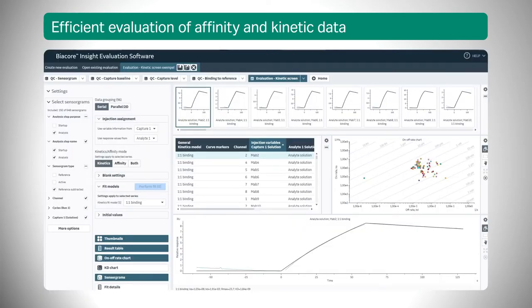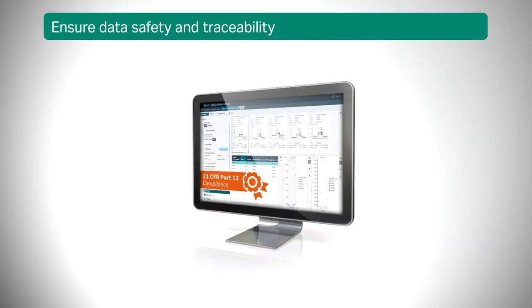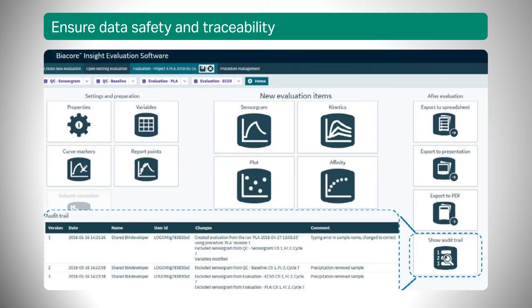Optional application-specific software extensions for screening, characterization, concentration, and potency determination expand the use of your system and enable you to explore different aspects of biomolecular interactions. A GXP software extension enables the use of Biacore systems in regulated environments.